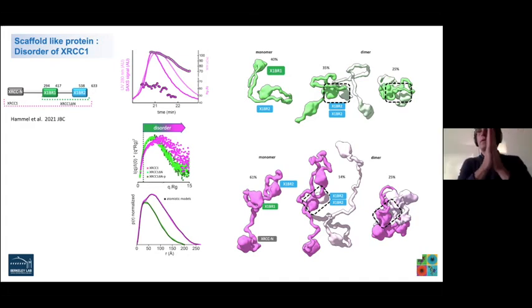Since Rob, you've been here, we did lots of upgrades. Even though we have a fixed camera, we extended the length. So the maximum size is about, I would say, 500 angstrom, 50 nanometers. So apoferritin at 50 nanometers, plus antibodies, plus anything, will be okay.